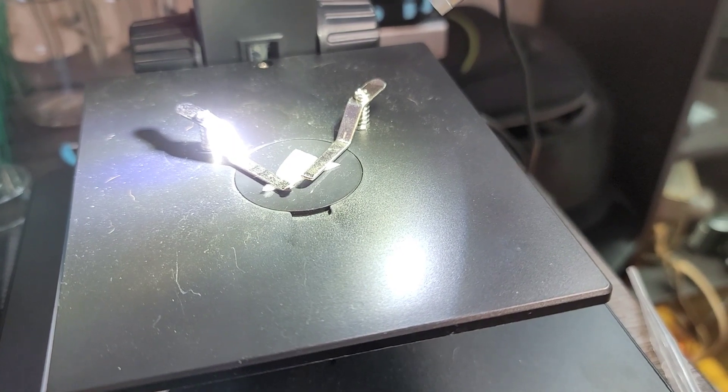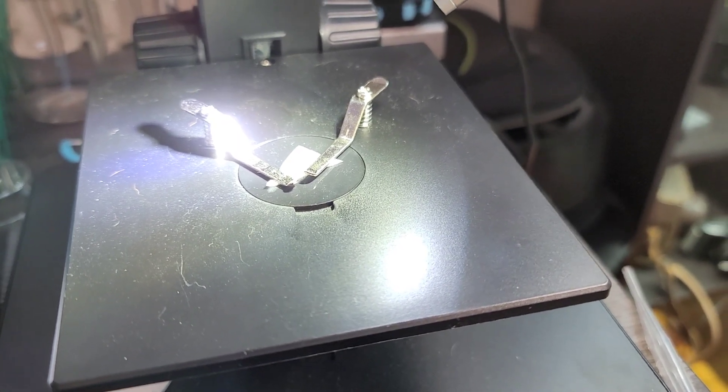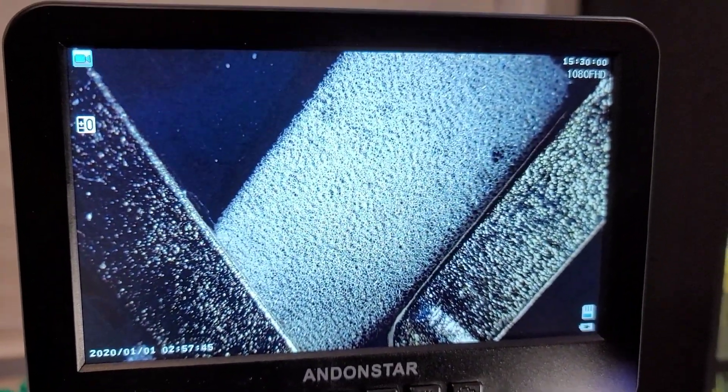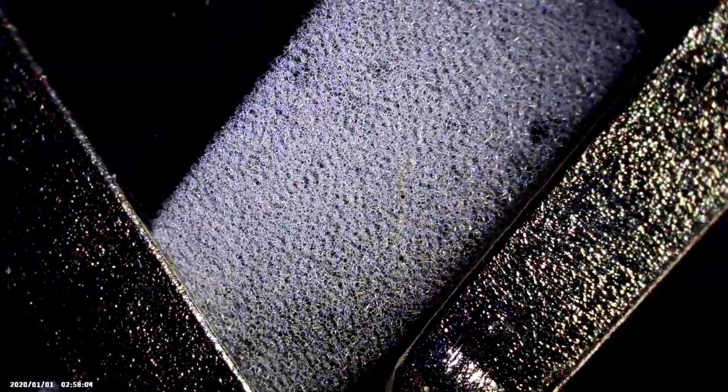I'll zoom in here and see if we can see anything. Now I had hoped that this was going to reveal a little more, but even zooming in as far as I could with this one, you really can't see the formation.